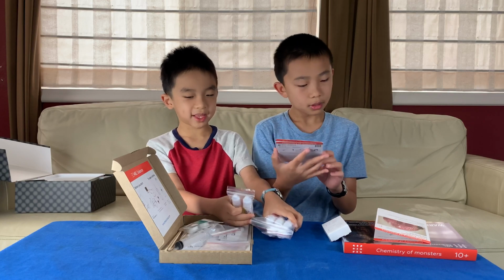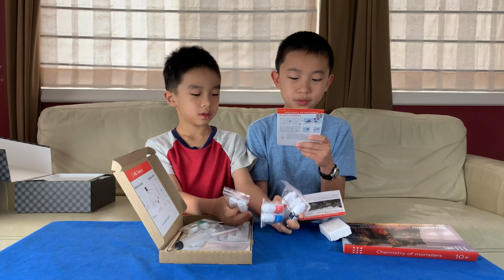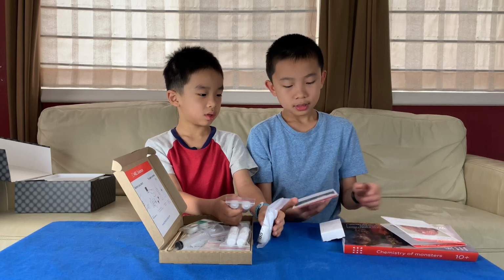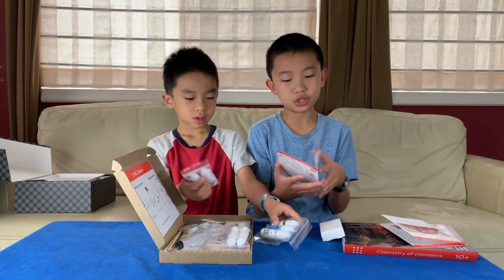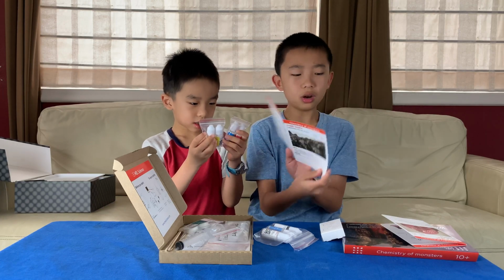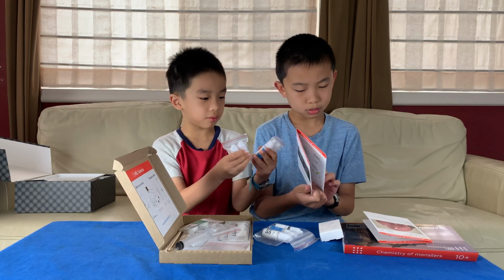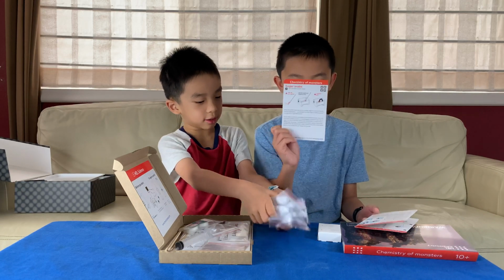Oh, they also have disposal instructions on both. For the foam, it says dispose of solid waste together with household garbage, pour solutions down the sink, wash with an excess of water. This one says dispose of solid waste together with household garbage. And then here are the instructions. Oh, this one has more instructions on the back, I guess. I think these are what we need to make the experiments. All these things.